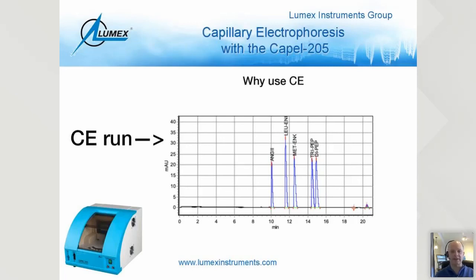And pH 3.0 using a bare fused silica capillary, there's no electroosmotic flow here, so we're only dependent on the charge of the actual compounds that we're trying to separate here. And of course, here we would talk about the pKa of those peptides. And that's kind of how I was able to use everything that I've taught you on part 1 and today to get this separation to occur.